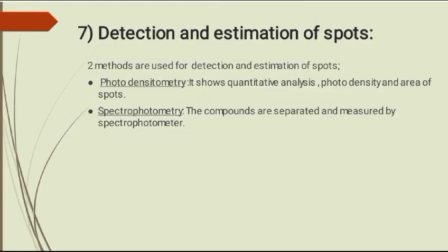Seventh step is detection and estimation of spots. Two methods are used. One is photodensitometry and the second is spectrophotometry.